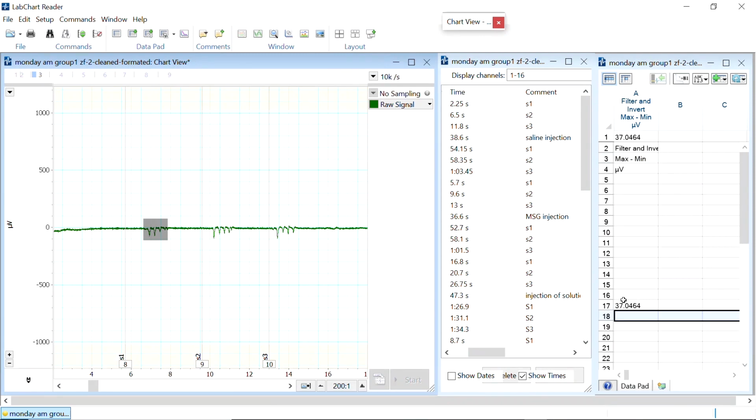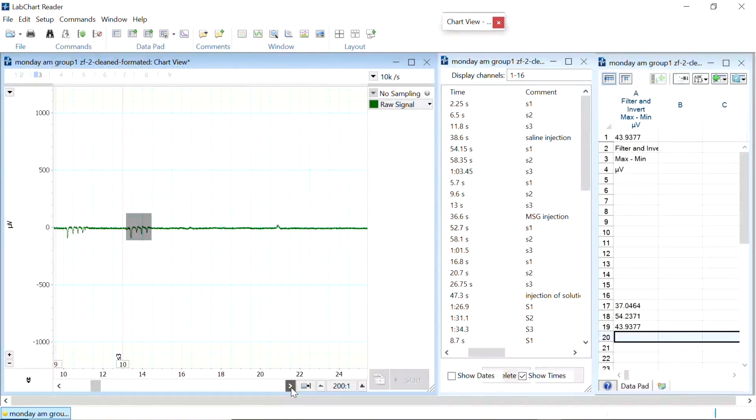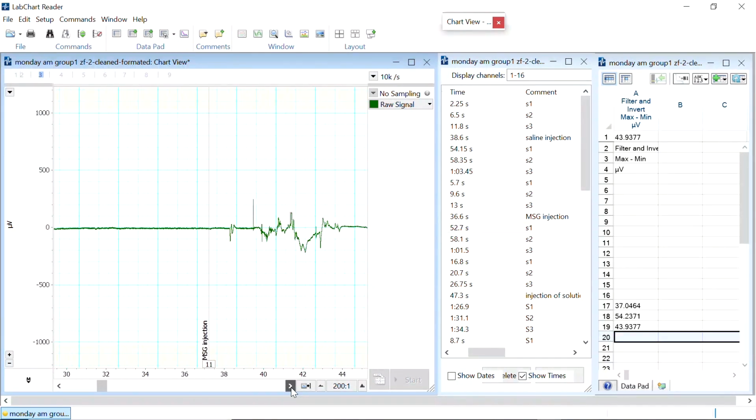And my data moves to here. That's completely fine. I mean, the software lost its mind. Anyway. And then second one. Okay, so keep adding here. And then the third one.